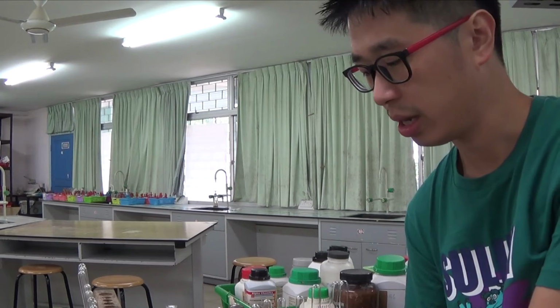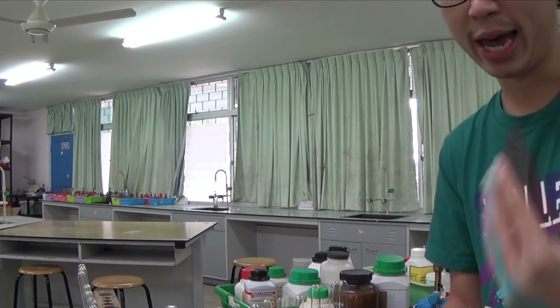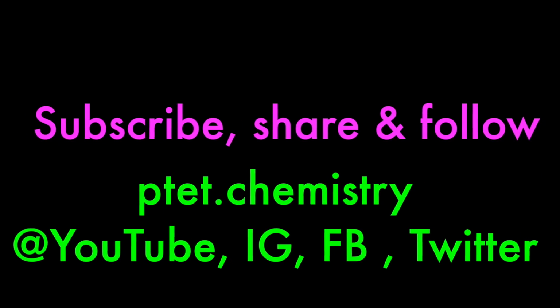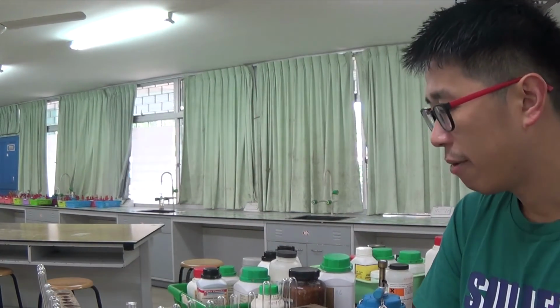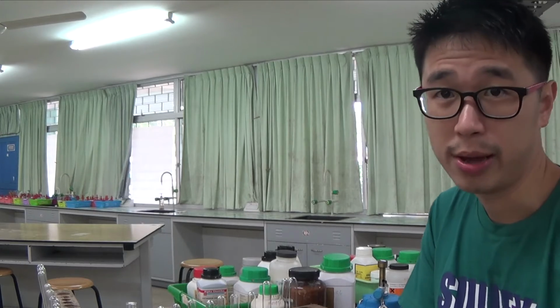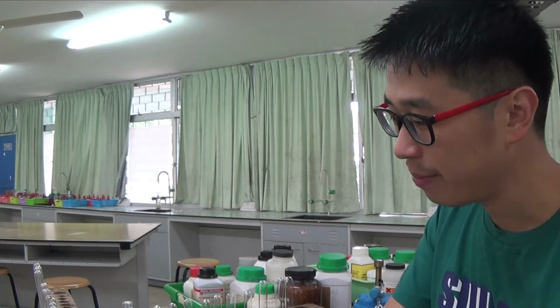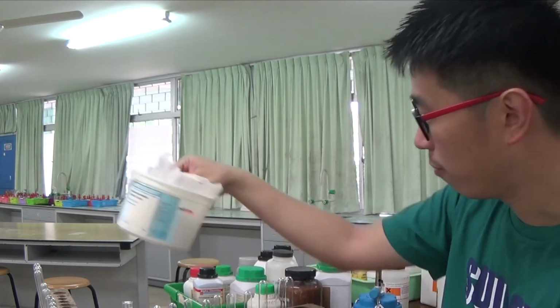So I will not heat any more substance now, because I just want to test for cations, and potentially the anion as well. That is the main objective of this tutorial. I just want to show you that they're hydrated and that they can give off water of crystallization.